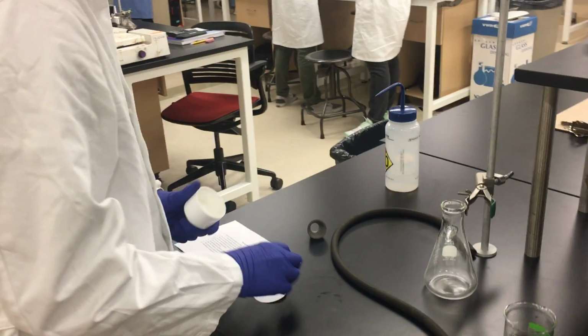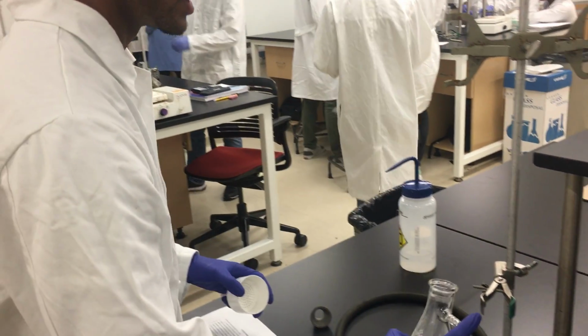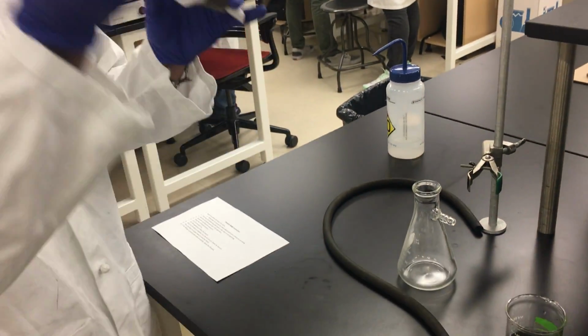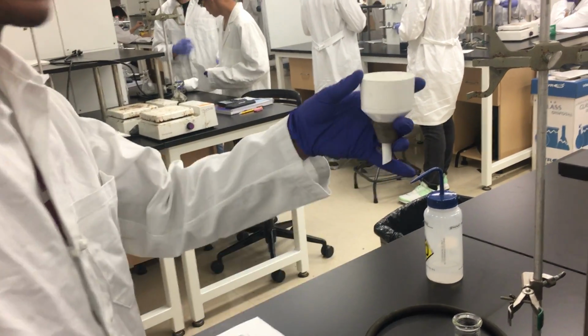We have a couple parts here. First off, this is the flask, and with the output we're going to be attaching the pipe. We're going to start by assembling the filter portion of it. We're going to put the plug over here. And we're going to take two filter papers right here. Two filter papers, we're going to place it inside right there and let it sit.